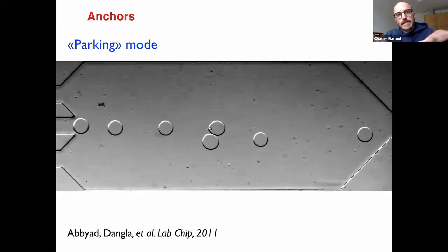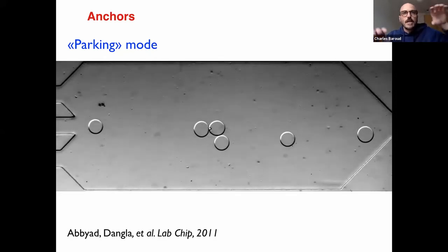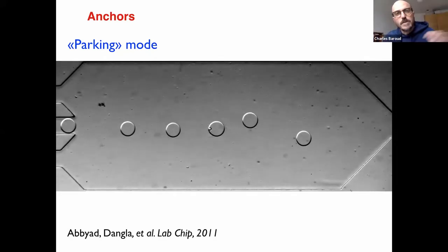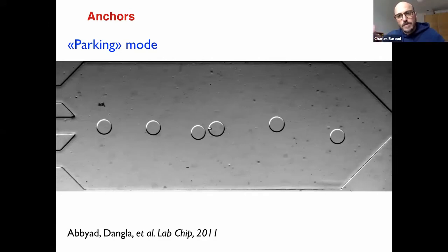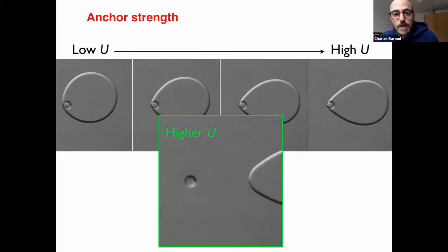These are quite simple microfluidic devices to make, but in this way, we can remove the side channels and we can have manipulation of the droplets everywhere in the channels simply by using the topography. So as good fluid dynamicists, what we wanted to learn initially was how do these devices work. I won't show you any of the technical details, but I will just show you that you're able to put one of these droplets in a device and you push it at different velocities. And as you increase the velocity, you see that the shape of the droplet changes. And if you move the velocity high enough, then you detach the droplet completely.